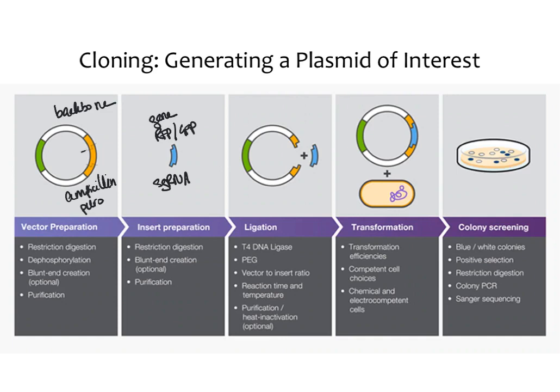So you make a cut. Here you can see your cuts, and these have the same cuts. And then you stick them together using a ligase, which is a ligation enzyme. When you do this, you end up with a complete plasmid that has all of your different parts. And now you're going to put it in bacteria, as we talked about before, in order to expand it. And then you're going to get all of your bacterial colonies that contain your plasmid. This is very commonly done in a lot of molecular biology labs, and it allows you to generate any plasmid that you're interested in studying.